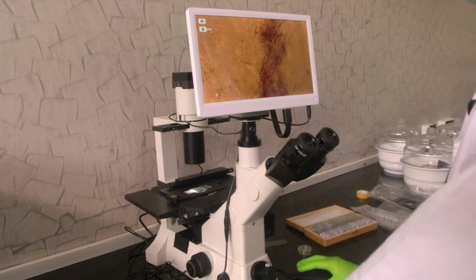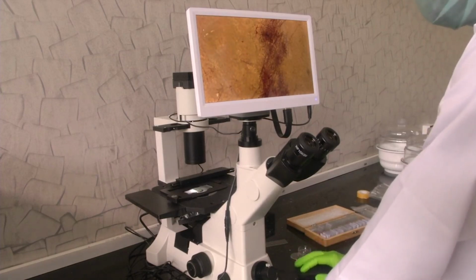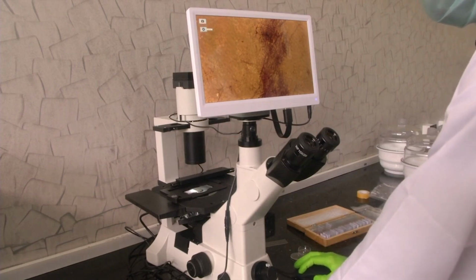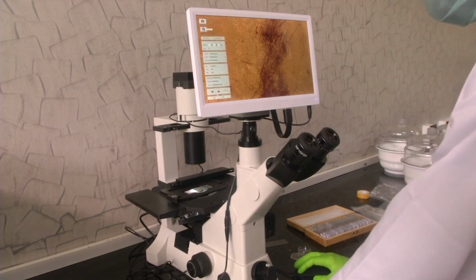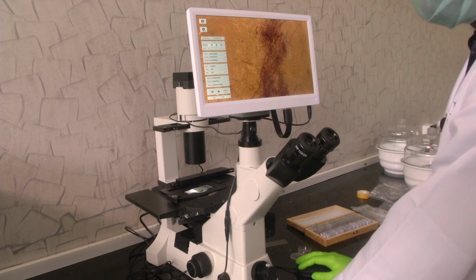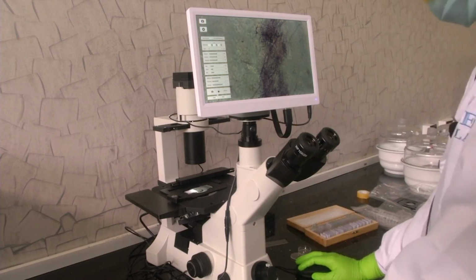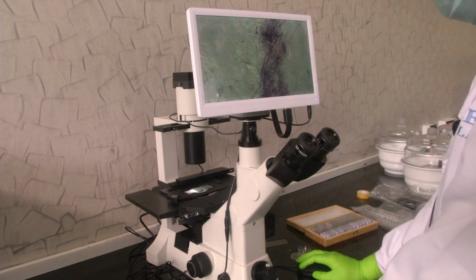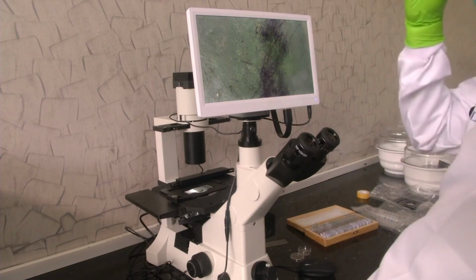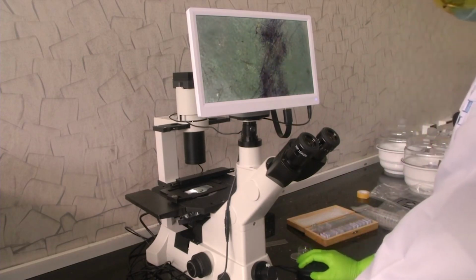Now, you see a yellow color hue in this image, right? Let us say we do not want it, we want to change this image. So, just go over with the mouse, go to the settings. See, there are red, green, blue adjustment, brightness adjustment, sharpness adjustment and all, and you can actually put white balance. So, we have removed white balance now. So, it has become almost black and white in color.